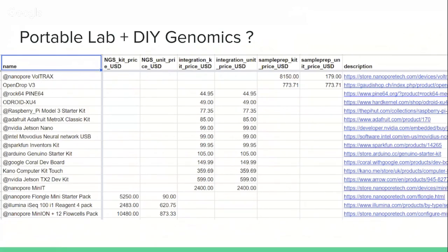We're reaching a point where people can start thinking about doing their own genomics experiments at home as private individuals, not associated to a scientific project with big budgets.